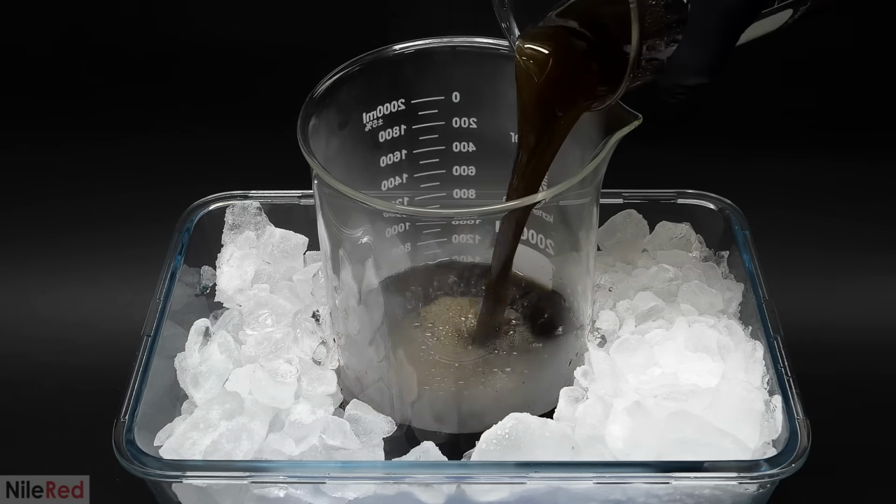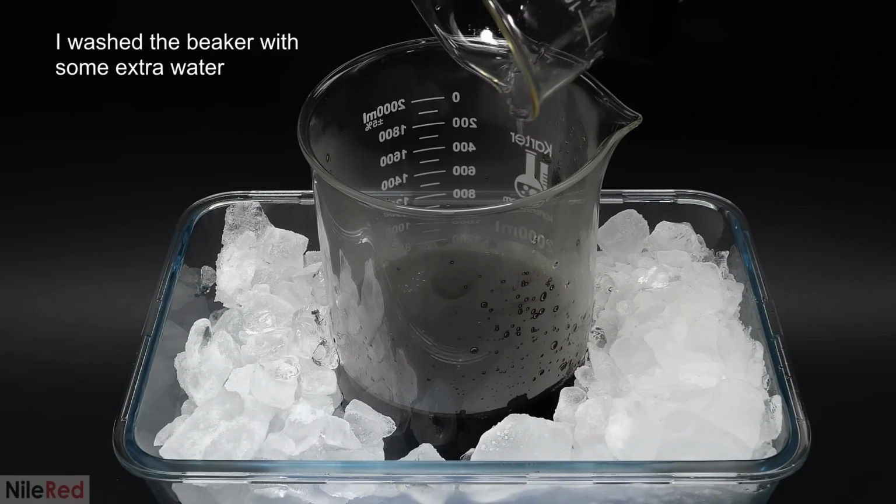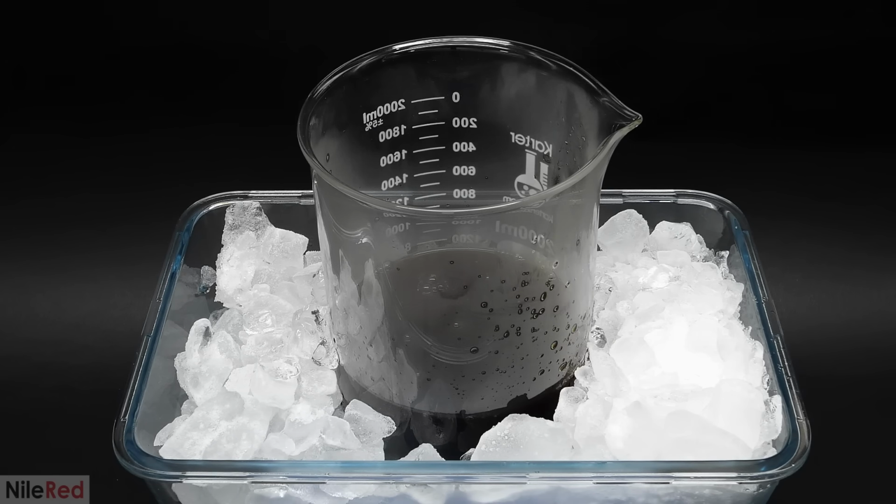When it was done, it looked about the same, and I poured all of this into an even larger beaker. This one was surrounded with ice to help cool things down, but it was still going to take a while. So, in the meantime, I prepared something else that I needed.